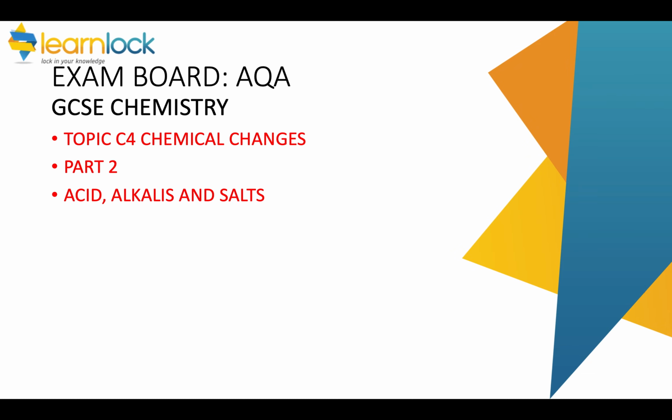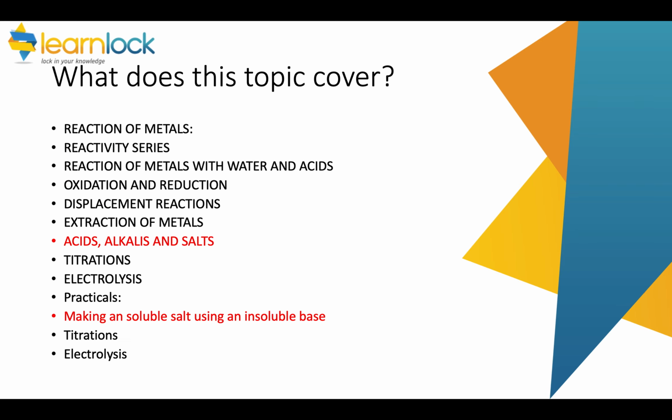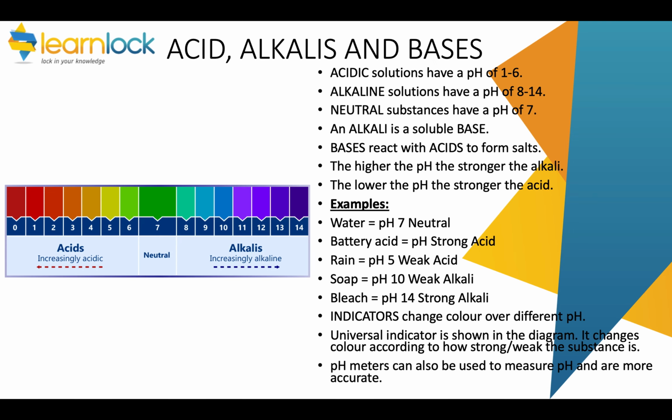Hello and welcome to the GCSE Chemistry tutorial for topic C4 Chemical Changes. This tutorial covers part 2: acids, alkalis and salts. We'll also be looking at a practical of making a soluble salt using an insoluble base.